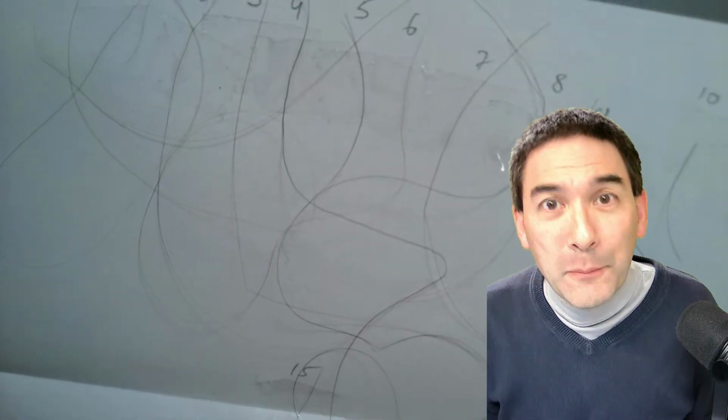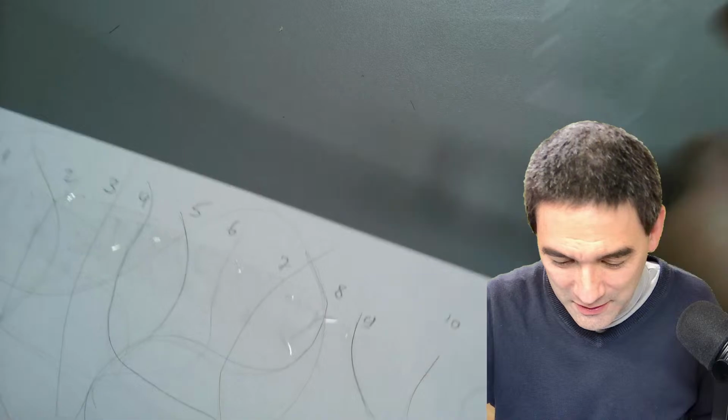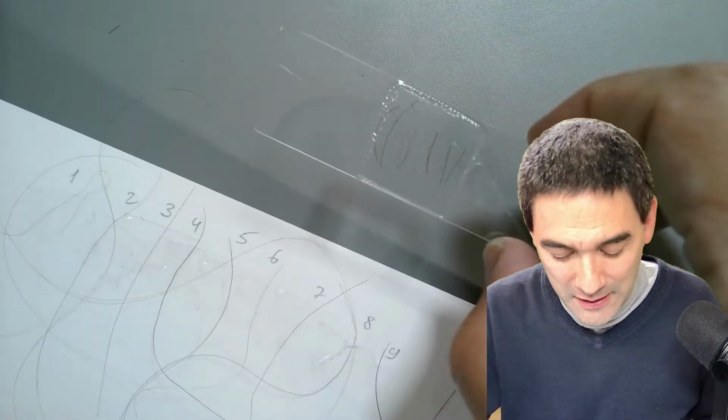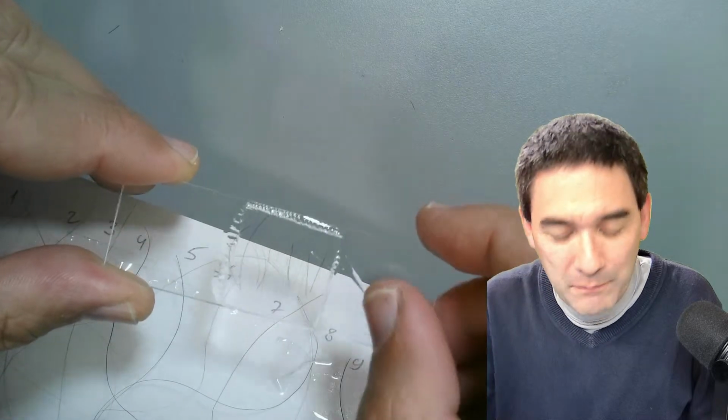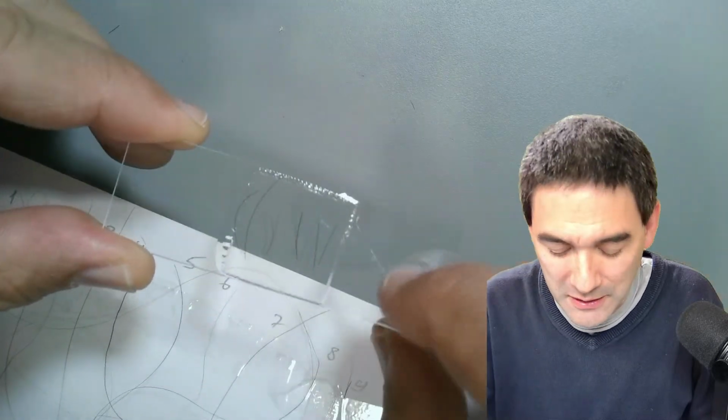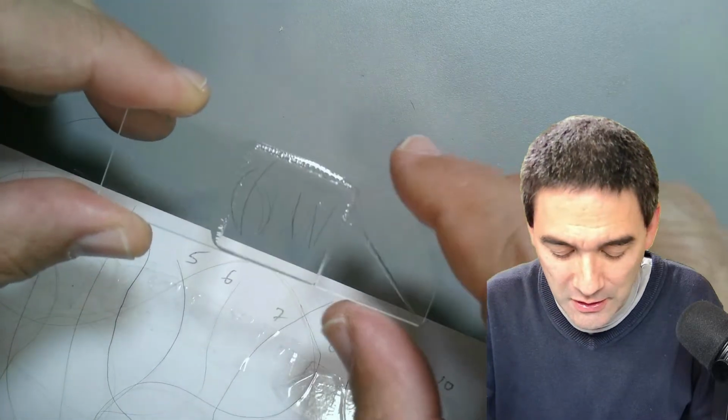And I did prepare a microscope slide because, of course, looking at it like this is not quite as convenient. What I've therefore done today in the morning, I arranged them also in a line here. It's not a very nice permanent mount. You see there's glue all over the place here, but it works.